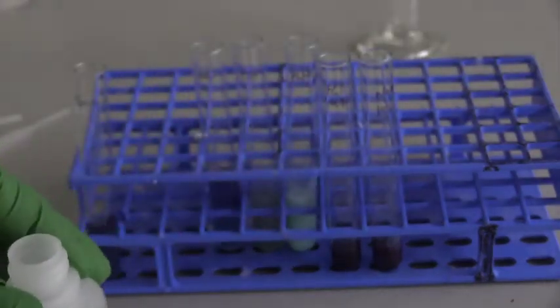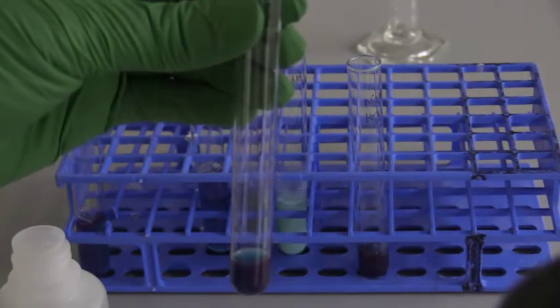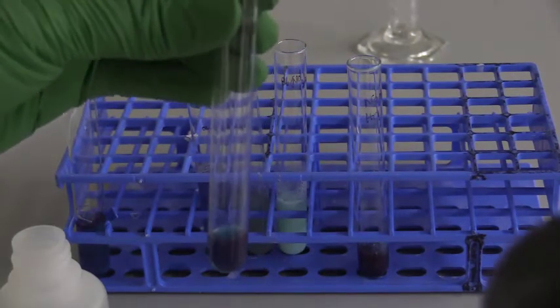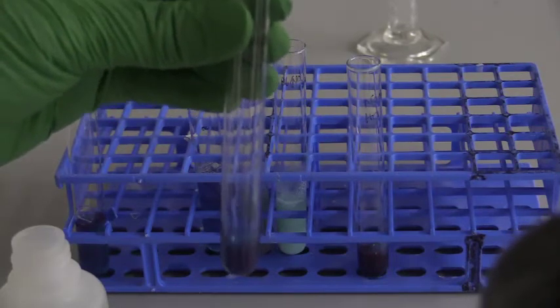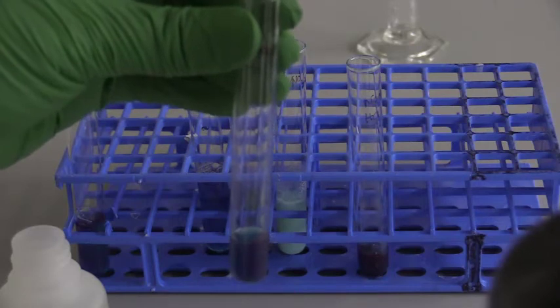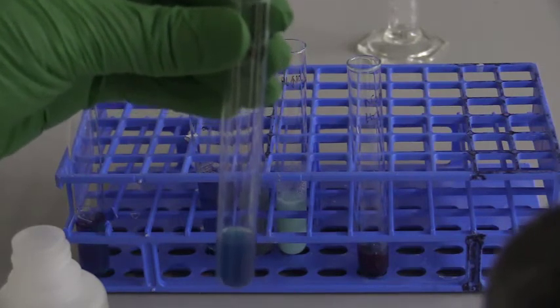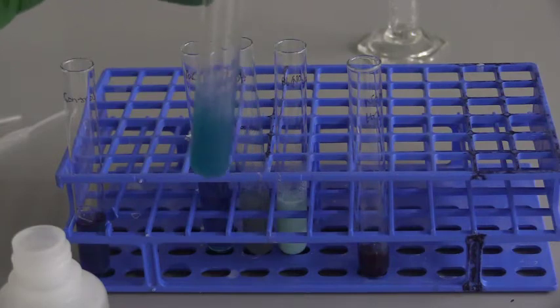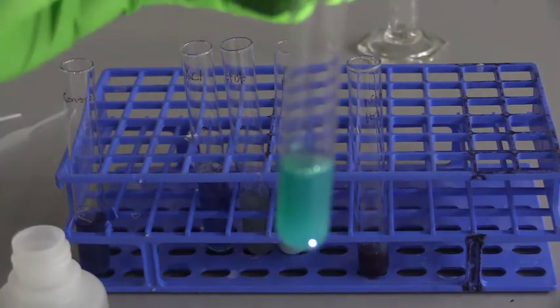Alright, for the next sample, we're going to add hydrochloric acid first. 1 ml of hydrochloric acid. Alright, you can make your observations about the color of the liquid and any other observations. And here's what it looks like with the light shined on it.